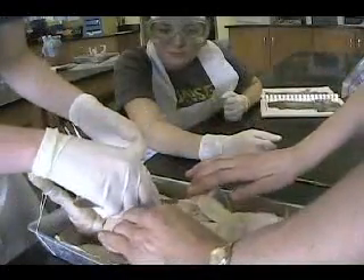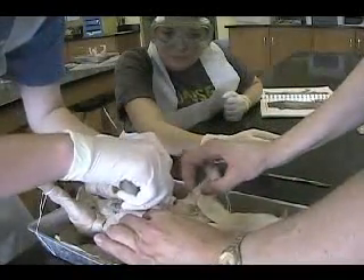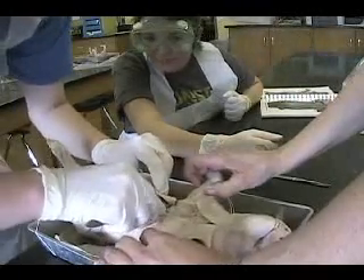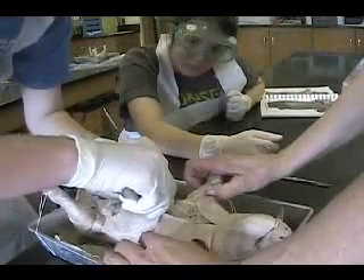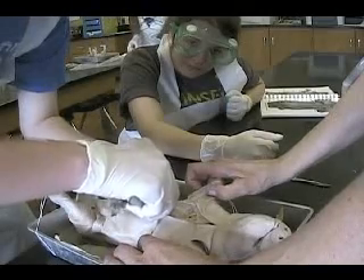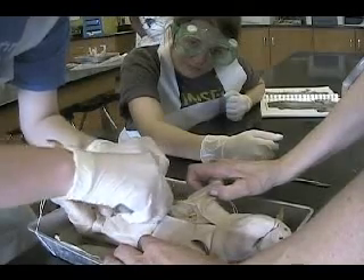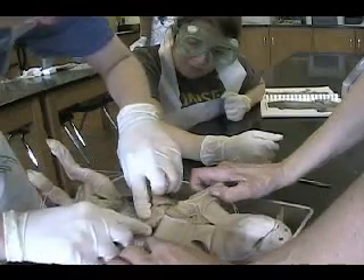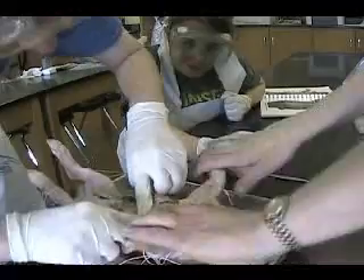Do you have to cut them? Why? What do you do? Right here? Yup, you need to pull. Get this away. You'll probably have to cut with scissors. Because they're cutting through bone. Or you can just crack it with your fingers, whatever you want. Alright, go over here. Thank you.